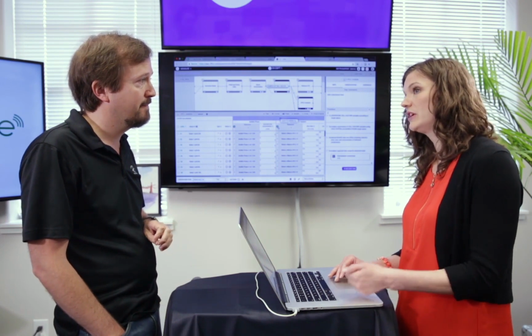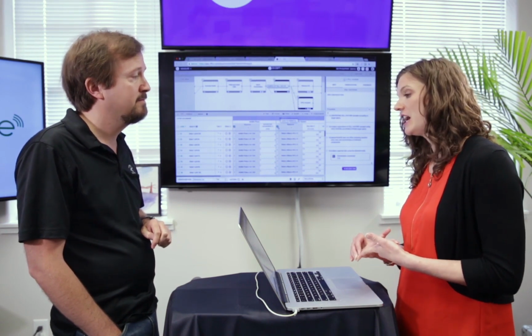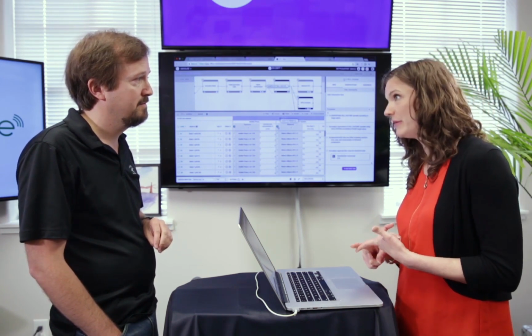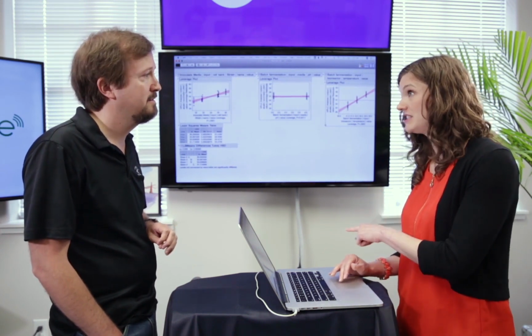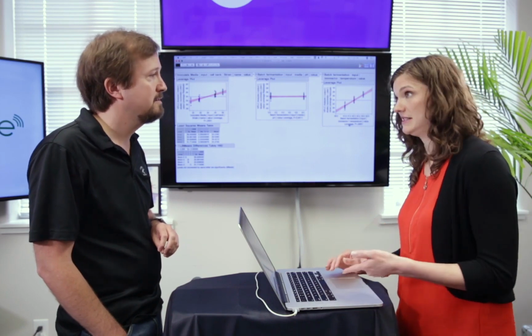Yeah, that's right. So one of our customers prior to using Riffyn said, we work on what we know, not necessarily what matters. And with Riffyn, we allow you to flip that around, and we allow you to work on what matters, not necessarily what you knew going into the experiment. Because once you do the analysis, you didn't know that temperature had such a large effect. Now we know it does. So now, moving to scale up, we know we need to control for temperature. And in fact, this looks like a good variable for us to vary to try and increase the yield of our strains.